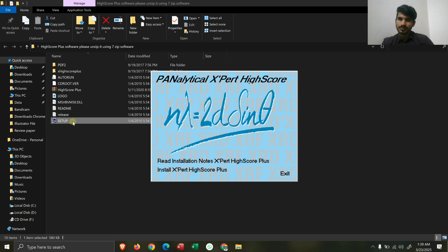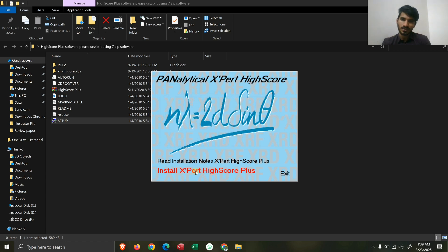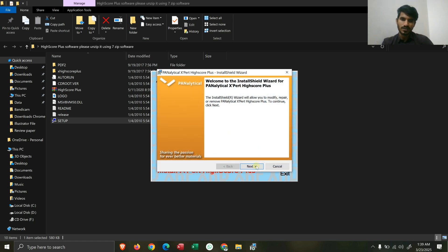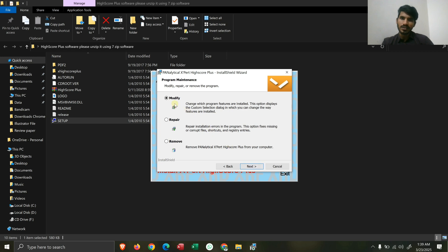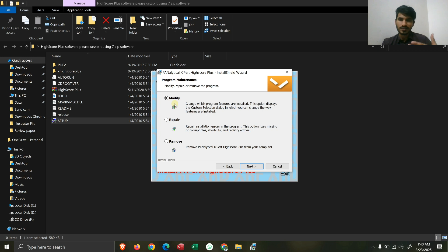Now click on the setup and here is the option to 'Install Expert HighScore Plus.' After clicking install, a new installer screen opens on your screen — click the Next button. If you have already installed Expert HighScore, an option will appear containing 'Modify,' 'Repair,' or 'Remove,' asking whether you want to modify, repair, or remove the already installed Expert HighScore.